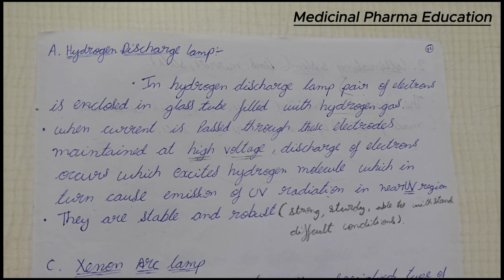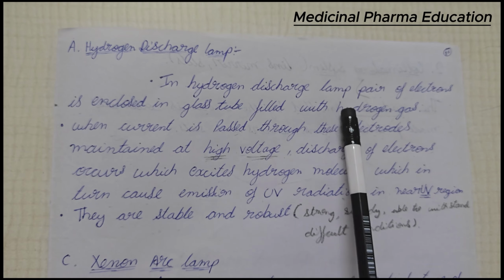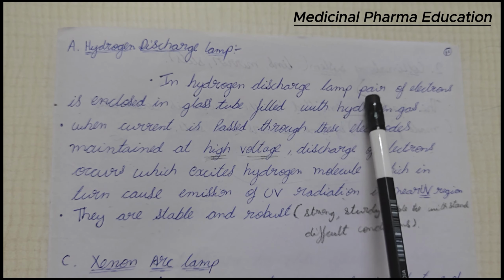The hydrogen discharge lamp. You can see the hydrogen discharge lamp contains, you can add it. Wait 1 minute.